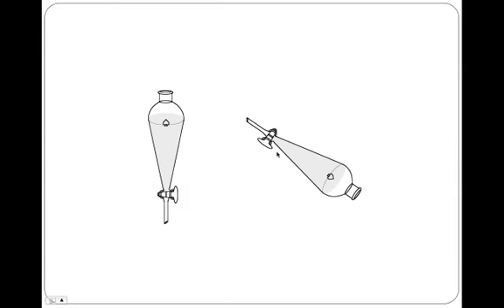When you open up the stopcock to allow vapors to equalize, you can then swirl this thing around, close the stopcock, put it back upright, the layers will separate, and then you can use the stopcock to drain the aqueous layer into one flask, the organic layer into another flask, and you've separated the two phases.